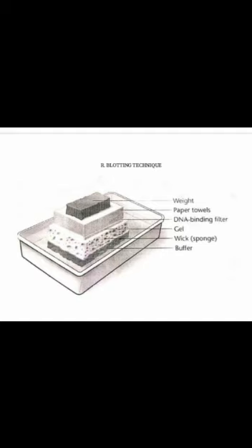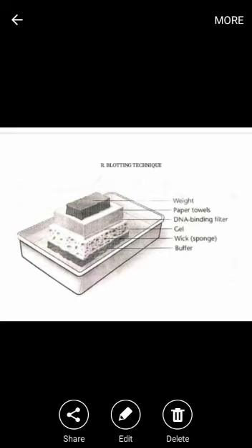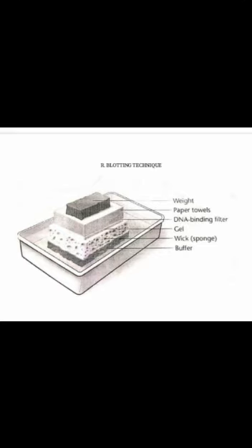By using blotting techniques, we can identify the infectious agent present in the sample. We can identify inherited disease, and the blotting technique can be applied to mapping restriction sites in a single copy gene.